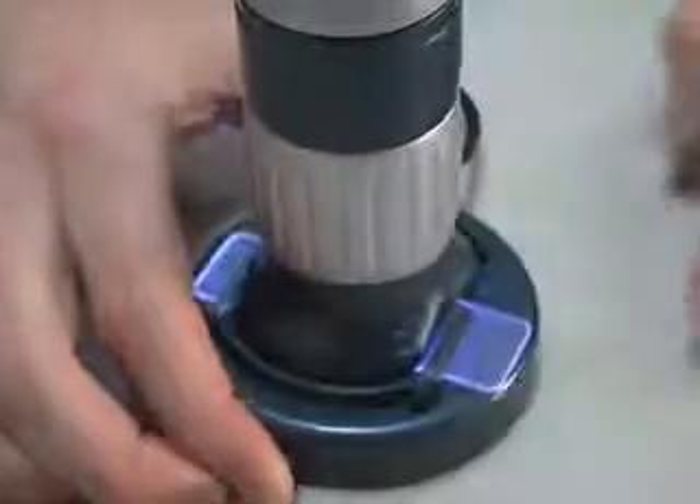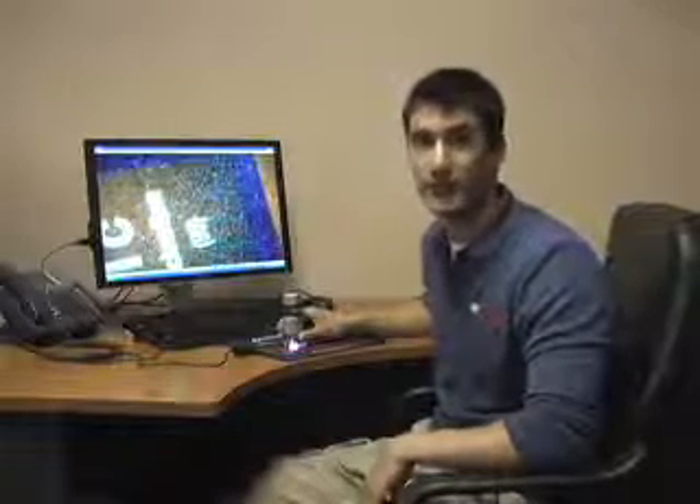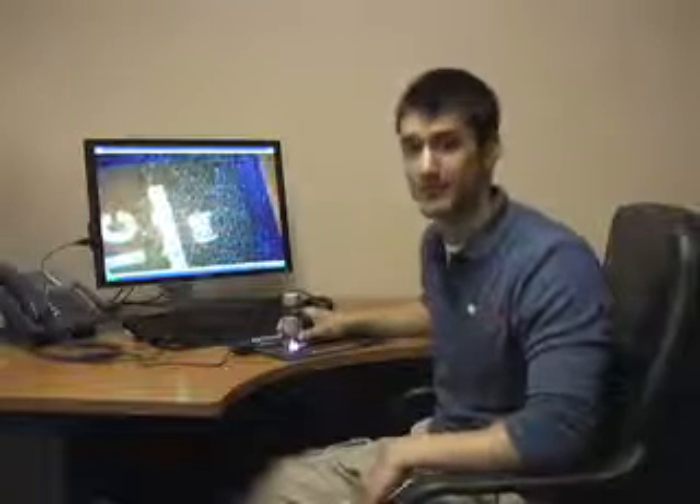Use the included base to view slides, or remove the base and place the microscope on any surface to reveal its finest details. The Z-Pix comes in two models: the Z-Pix and the Z-Pix 200. The Z-Pix has a resolution of 640x480 and the Z-Pix 200 has a resolution of 1.3 megapixels.